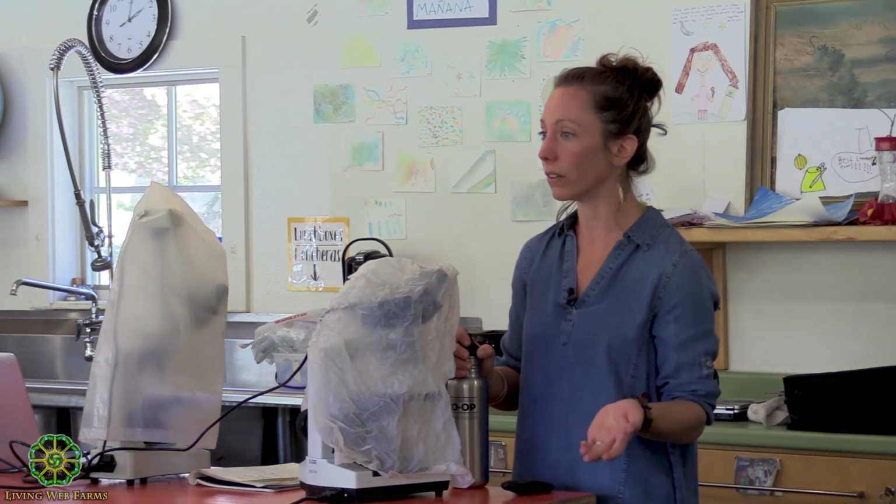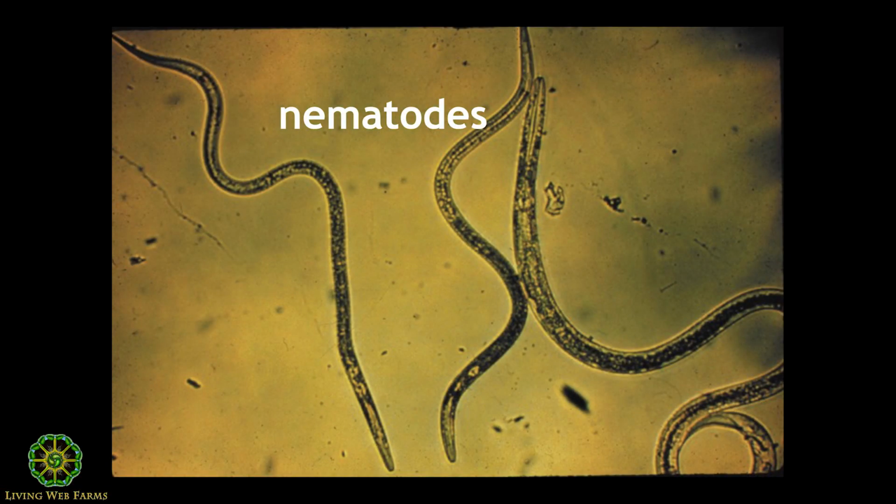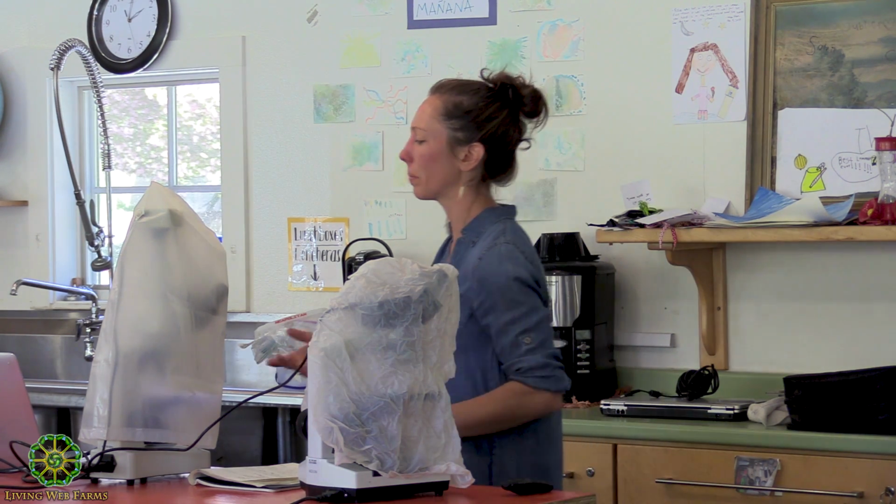Think about it. If there's no fungi in your soil, you're not going to have fungal feeding nematodes, right? Depending on what you're looking at. If anybody brought worm castings, I almost always see nematodes in worm castings when I look at them. But you'll probably see some bacterial feeders in there. And I have a few more pictures, I think.